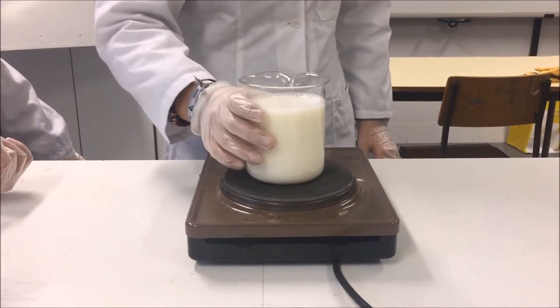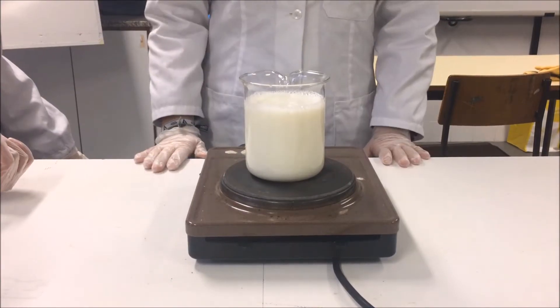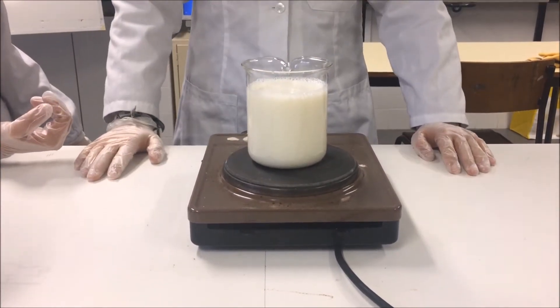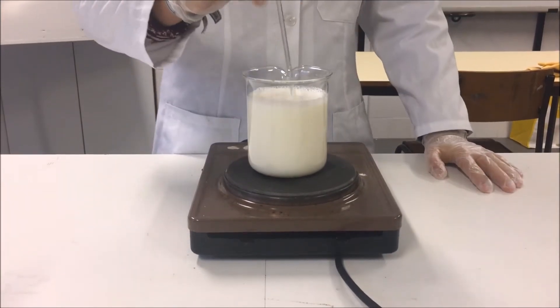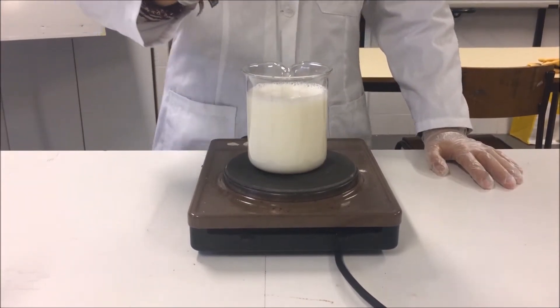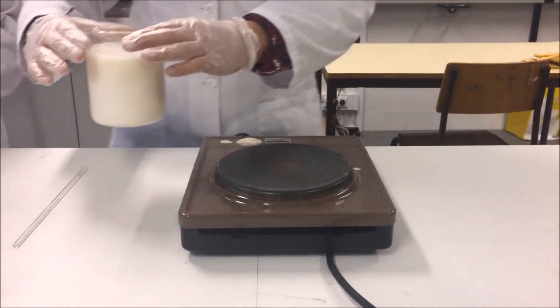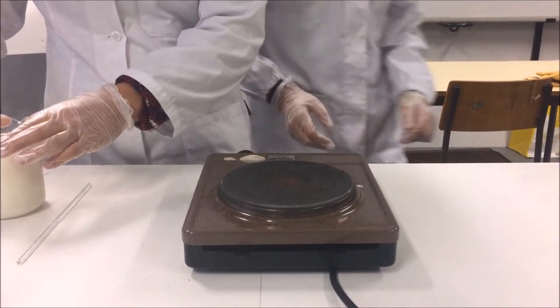Place the beaker with the milk on the heating plate and wait for the temperature to rise without boiling, stirring continuously with the glass rod so that the milk is heated evenly. To avoid burns, remove the beaker carefully from the heating plate.